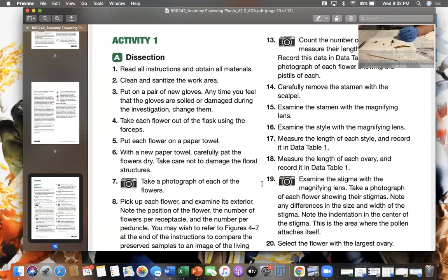The honeysuckle should be fine. All right, now hopefully your hands are still clean. Okay, now we just want to gently kind of try to get all excess preservative off. Without crushing.